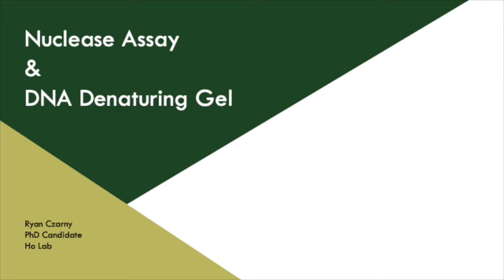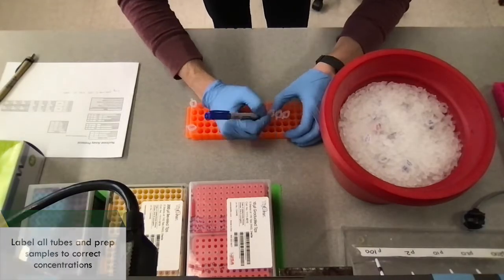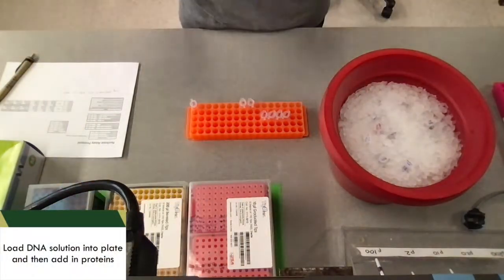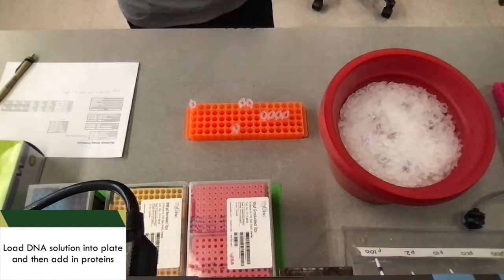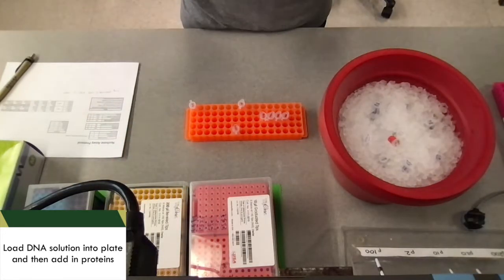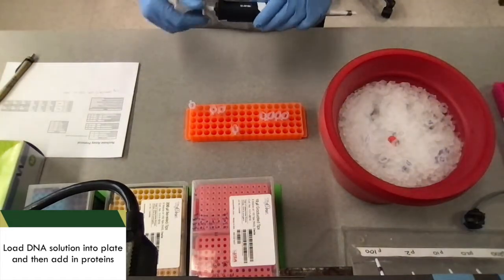Welcome to this video where I'm going to be talking about nuclease assays and DNA denaturing gels. To start out, we need to make sure that we have all of our tubes labeled with our different proteins, and then we're going to load a DNA solution into a plate so that we can add in the proteins after that. Make sure that you keep your DNA on ice because it'll keep it more stable. It's not completely necessary, but good practice to do.